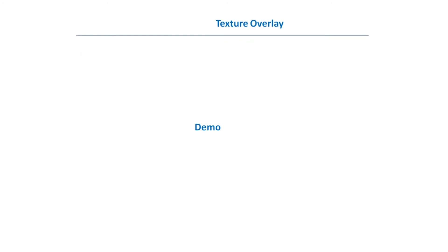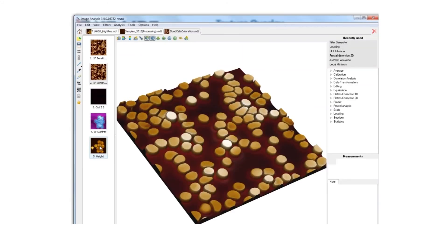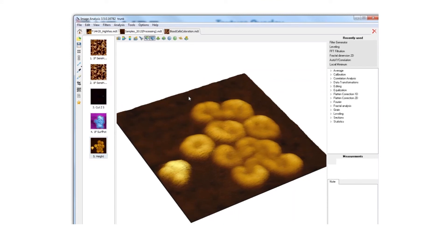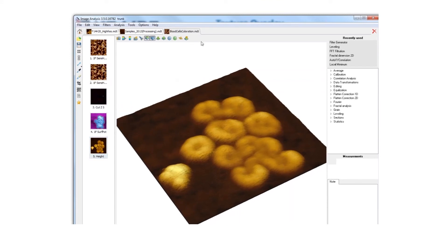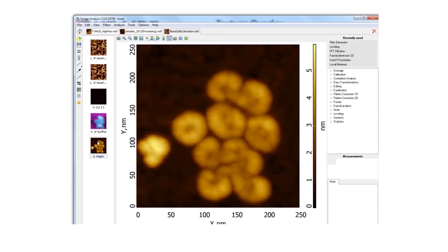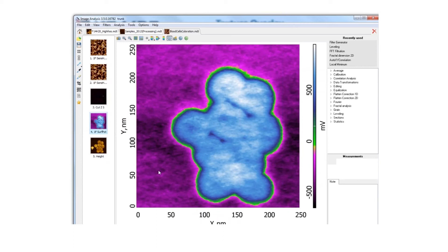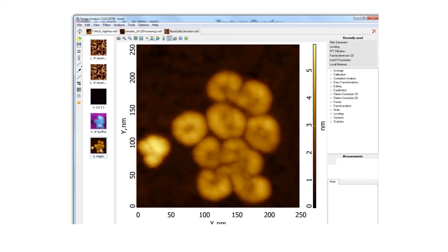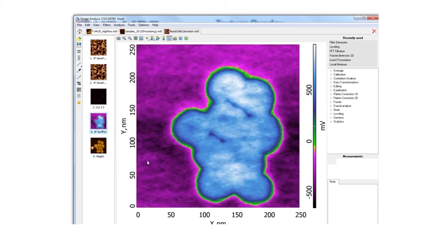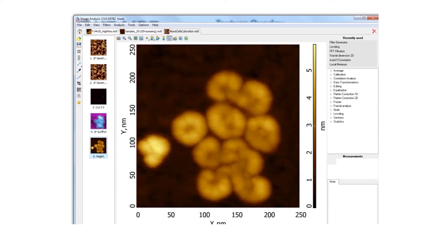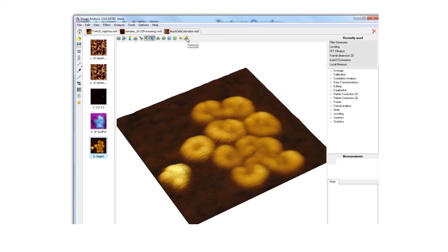One more example about 3D: in our new software we can make a 3D overlay. We have two scans of fluorinated alkanes — the topography and the surface potential of the same area. You can notice that a certain feature is not seen in the surface potential; why, you can read in our application notes. To highlight this fact, I go to the 3D view and press the texture button.